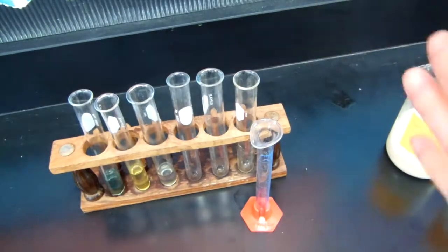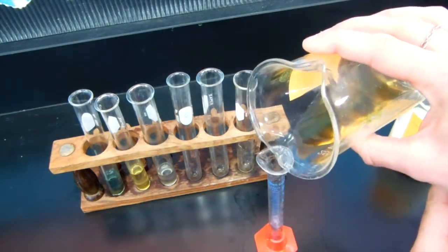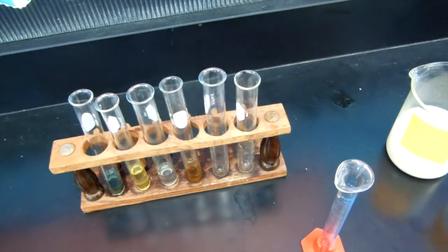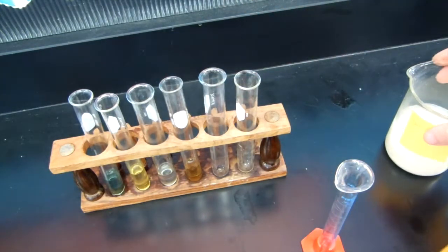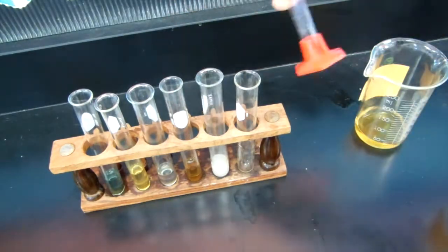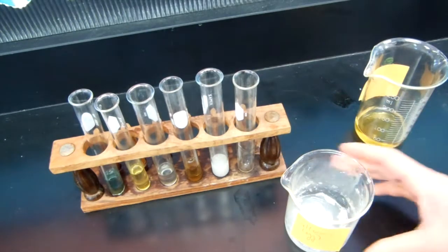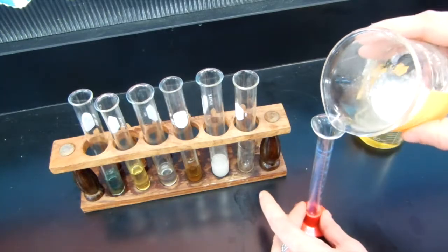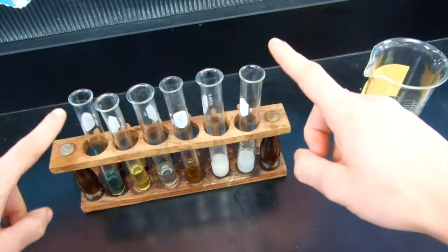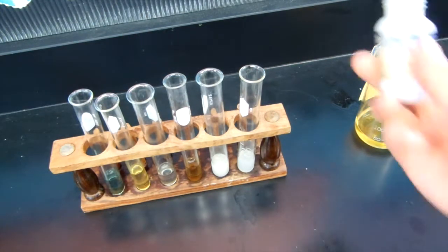So I'm going to go ahead and measure out 5 mils of the apple juice. The next one is going to be the oatmeal water. And then this one is going to be the albumin. So we'll go through these again. I'm going to go ahead and put the Benedict 10 drops in the apple juice.